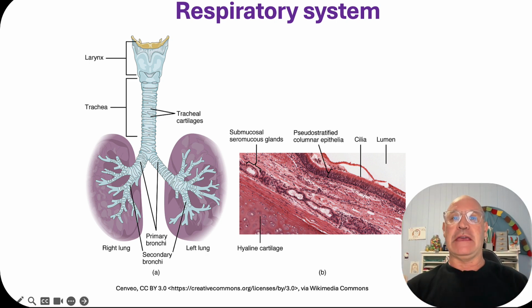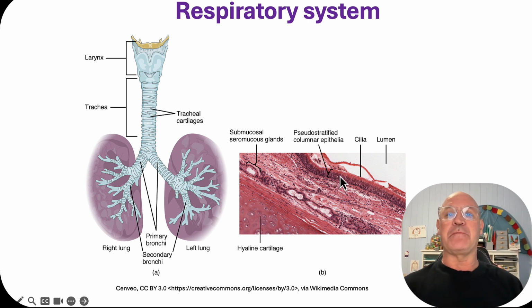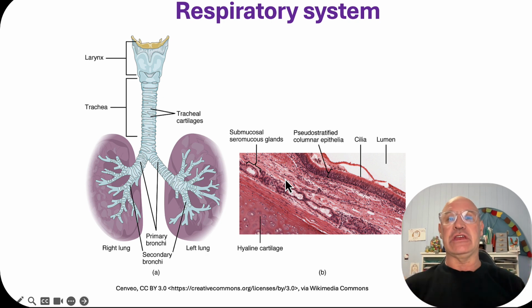So we know that it's the epithelial tissue that is in sheets that covers the outer and inner surfaces of, say, the human organism. So we're expecting to see epithelium here, and we certainly do. They're the columns of epithelium, and they've got the cilia, the specialized hair-like projections that move the mucus up into the throat. These also secrete mucus as well. Now, below the epithelium, we have some connective tissue, and it's loose connective tissue.